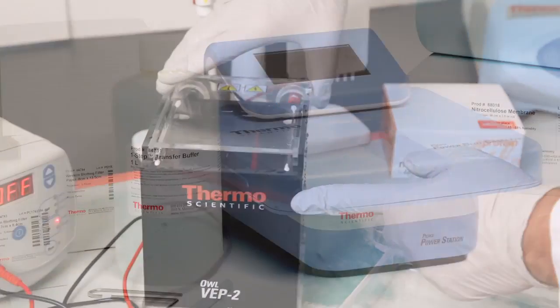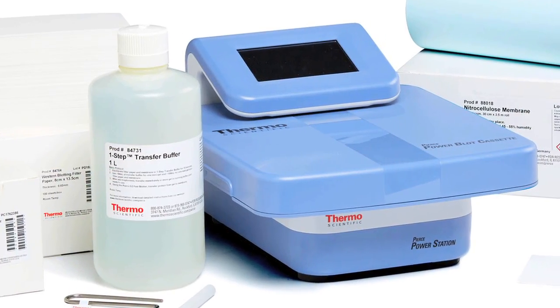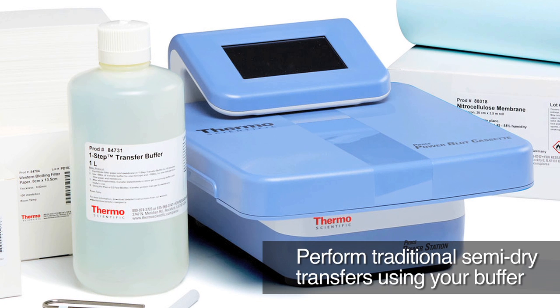The Pierce Power Blotter can also be used to perform traditional semi-dry transfers using your buffer and method of choice.